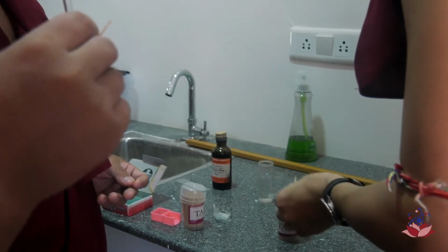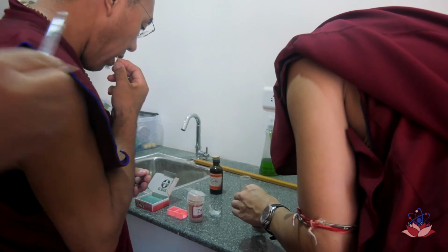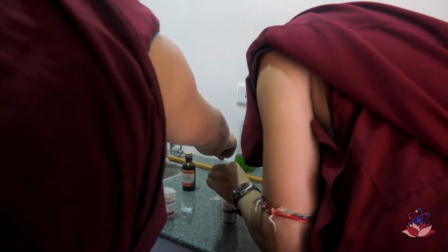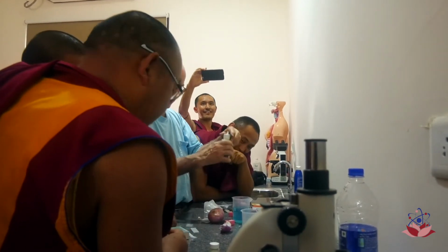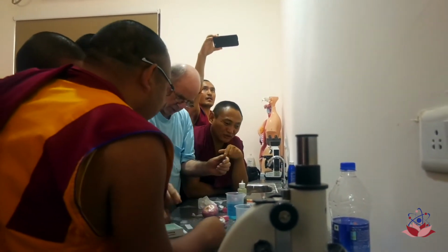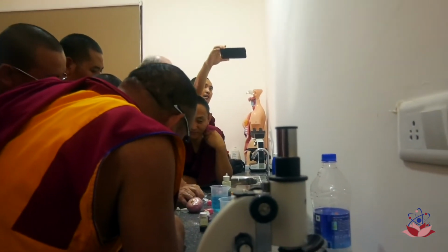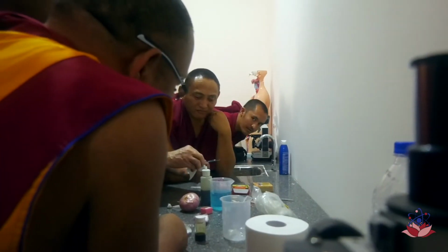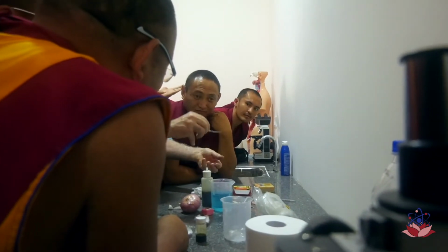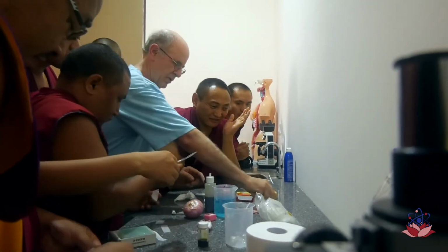Then swirl it in the water. This is the dye. One of the cover slips. Put it on. So now it's wet. Then go look at it. And this one, that's it. Be very careful.